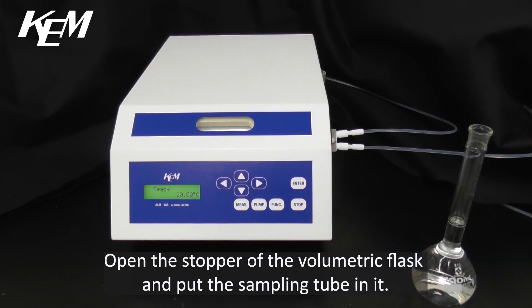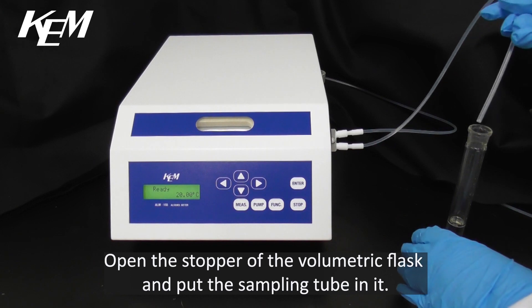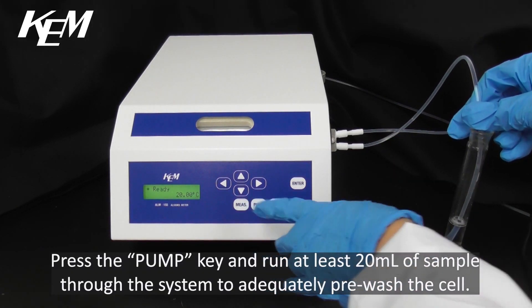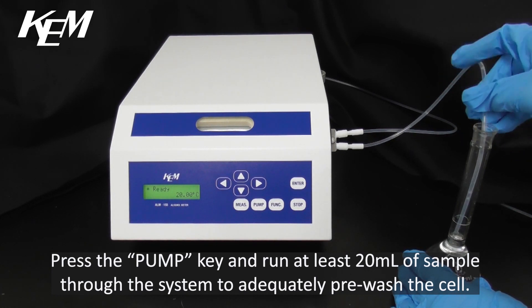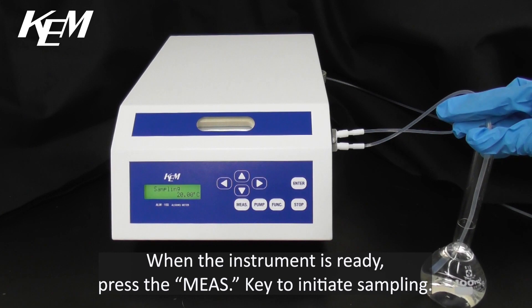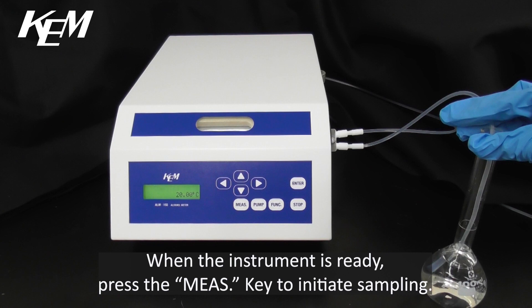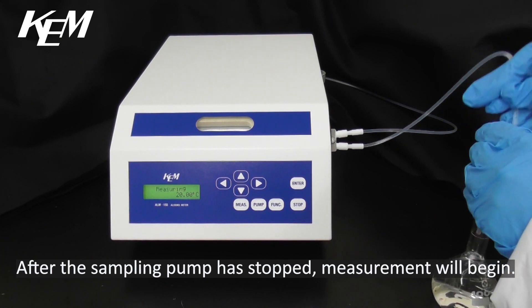Open the stopper of the volumetric flask and put the sampling tube in it. Press the pump key and run at least 20ml of sample through the system to adequately pre-wash the cell. When the instrument is ready, press the measure key to initiate sampling. After the sampling pump has stopped, measurement will begin.